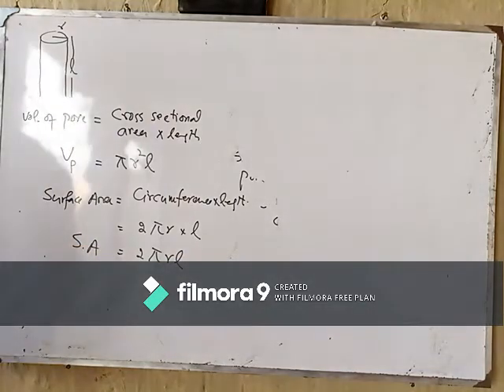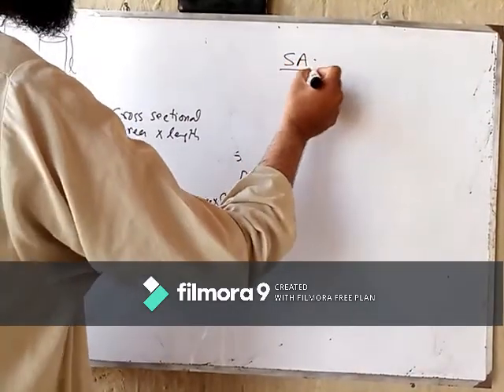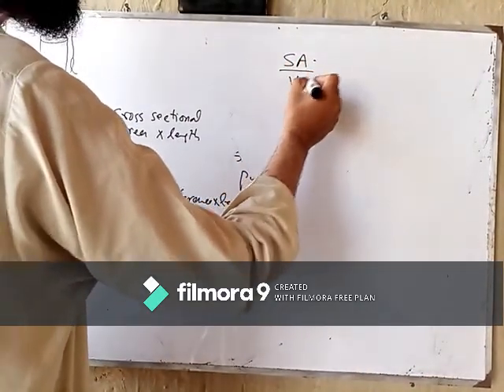So ratio of the surface area by volume of the pore.